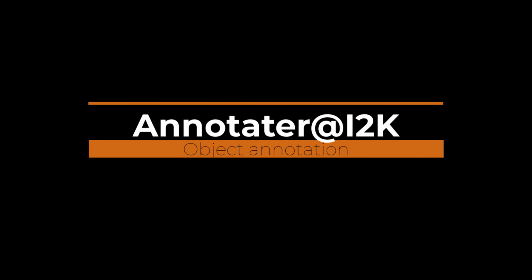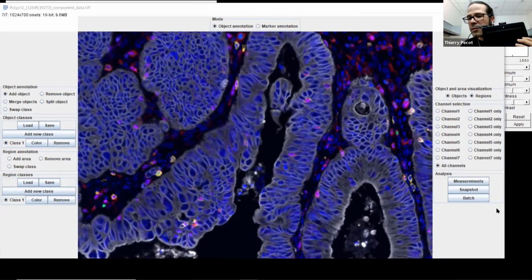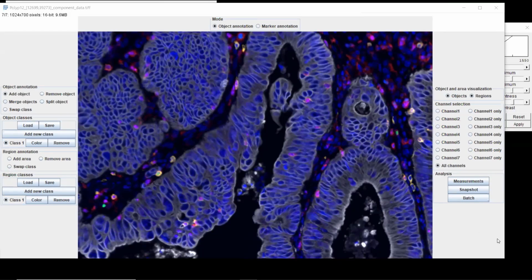I'm just going to show you. So I don't know if you can see. I saw it in the presentation of the workshop, but it's better to have a drawing tablet like this, something you can use a pen directly on. It's fairly cheap, just about $60 here, and it saves you a lot of time when you need to annotate images. So I'm going to use it to show you how you can annotate.